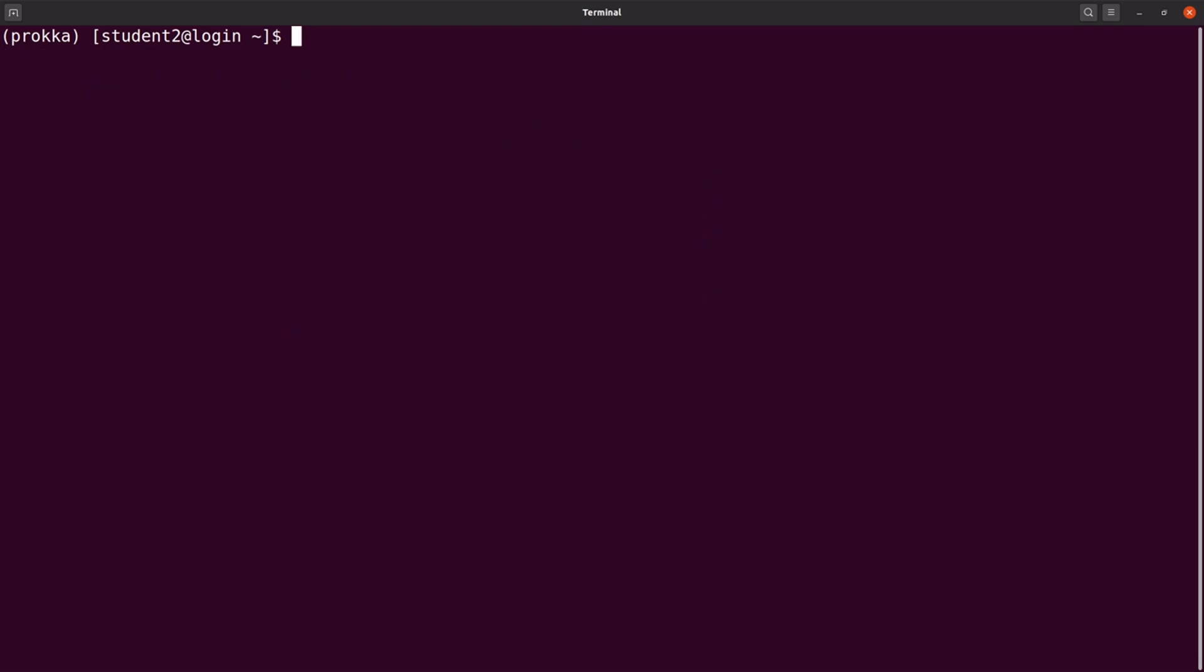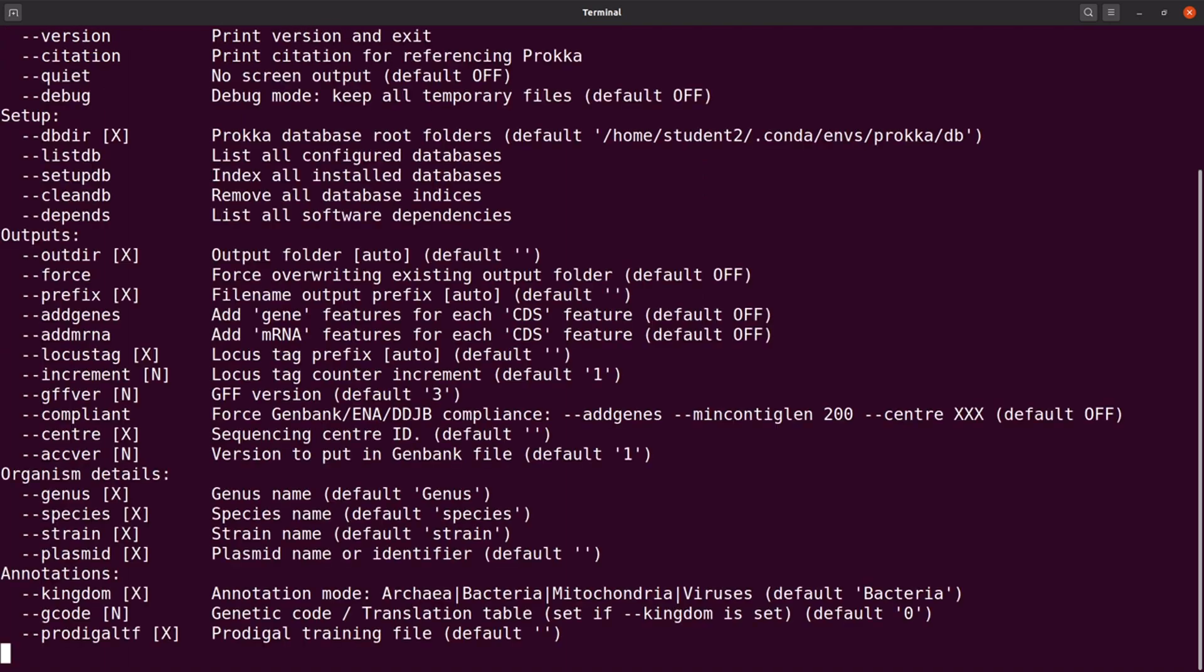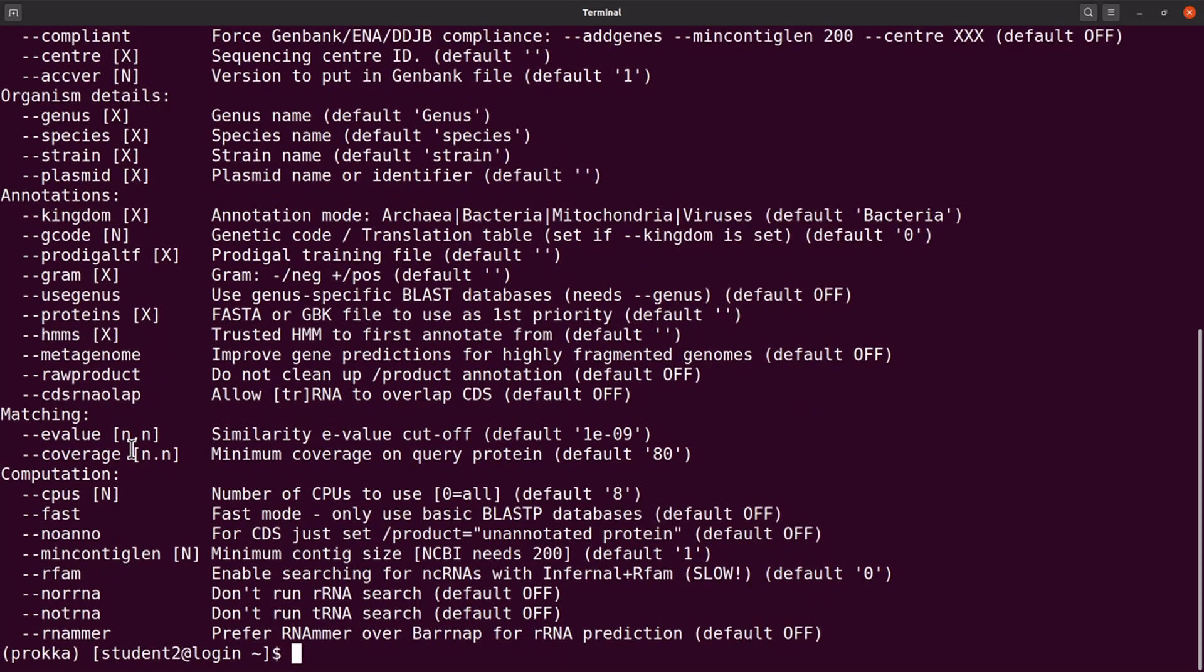Let me clear the screen first. Before we run Prokka, let me see, let's call Prokka again. And then we have the options displayed here. So we are going to use a few of these options.